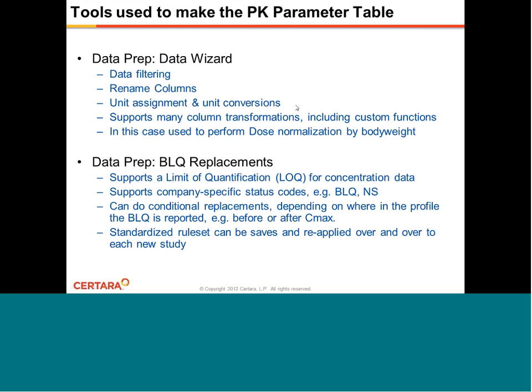So, the Phoenix tools used to make the PK parameter table. In this workflow, there's some data prep involved using the data wizard. This was used to perform the dose normalization by body weight. It's also a standard practice to do the BLQ replacements.